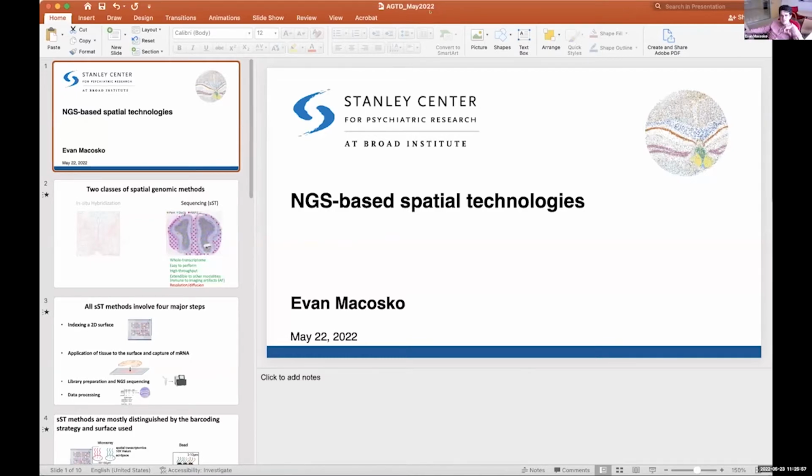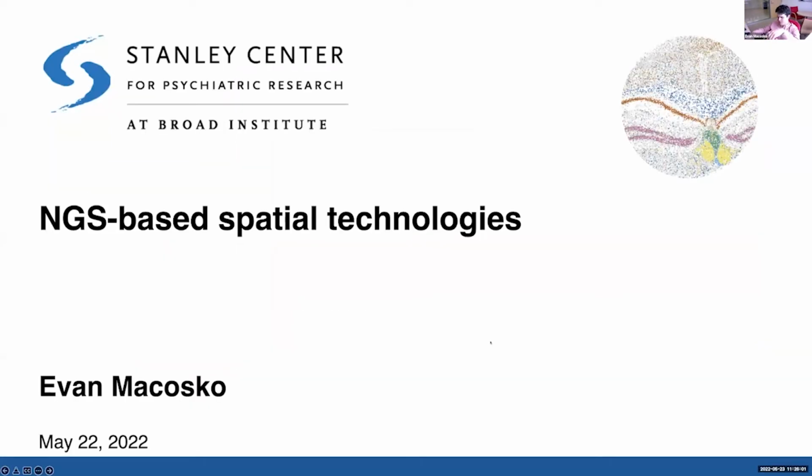Thank you, Sophia. Thank you, Faye, also for introducing some of these concepts, so it'll be easier for me to get into some of the details. I'll be talking now, in detail, about these spatial technologies that utilize next generation sequencing as a readout for gene expression.